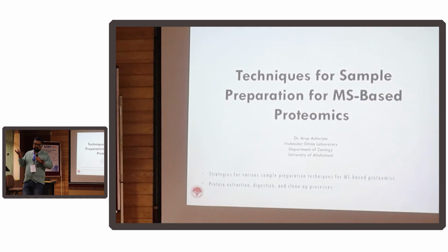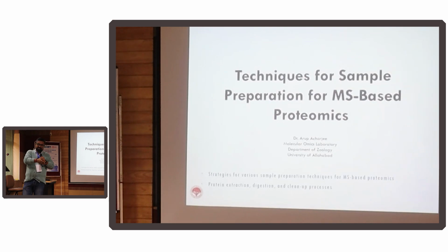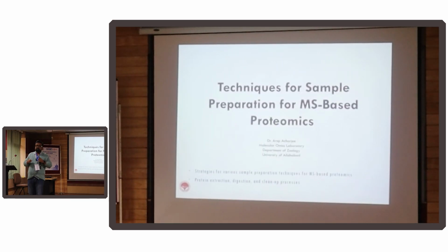I was discussing with a friend, and we thought: what is mass spectrometry based proteomics? It's the use of physics to identify the chemistry behind biology. So it's quite varied, and beyond physics, now we have Professor Graham who will tell how to use mathematics to make sense of it. So it's quite interdisciplinary. You just dived into mathematics.